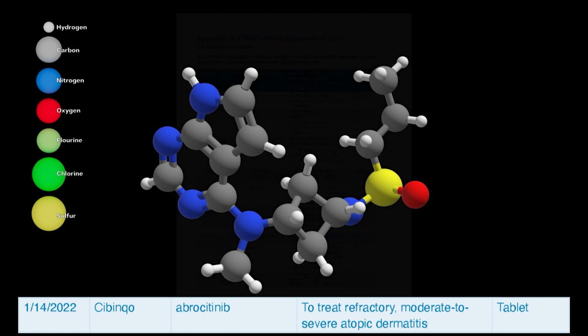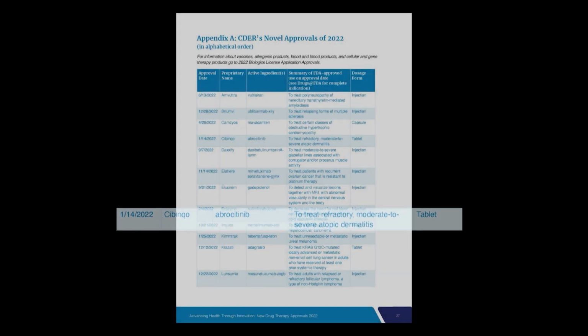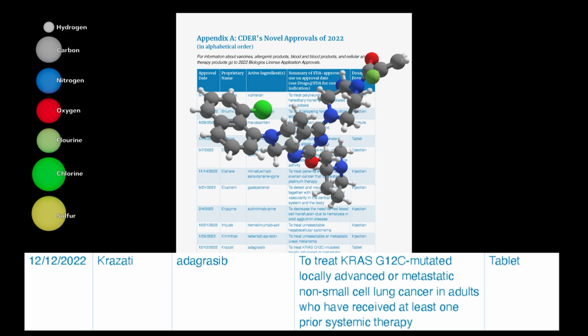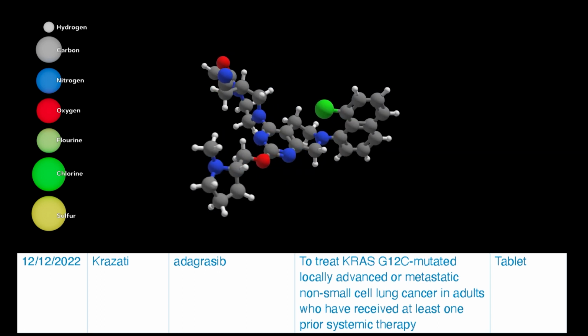Step 1. For compound screening. In the early stages of drug discovery, researchers screen large compound libraries to identify potential lead compounds with desired biological activities. HPLC is used to separate and analyze these compounds based on their physicochemical properties, such as polarity, molecular weight, and solubility.